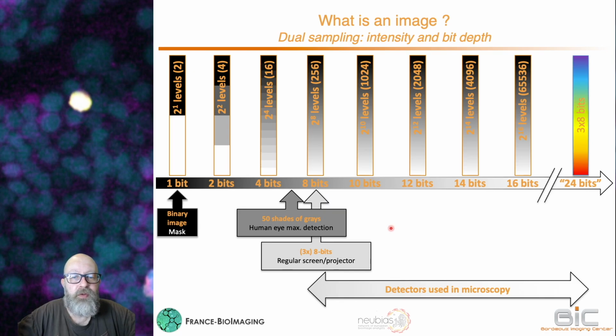It is important to note that our eye is really bad at quantifying, at comparing stuff, and at purely quantifying a signal. The human eye is able to distinguish roughly 50 shades of gray, and formulating it that way, it's easier to remember, of course. At the moment, I've been only talking about 8 bits, 16 bits, and you see from the representation that these are gray levels. You would ask, yeah, well, what about color?